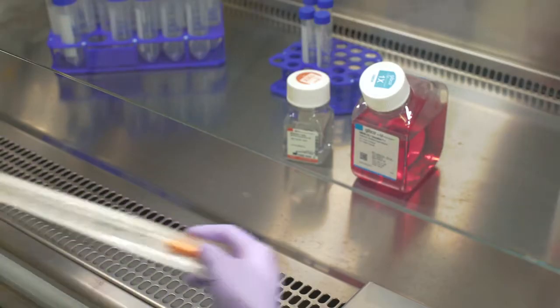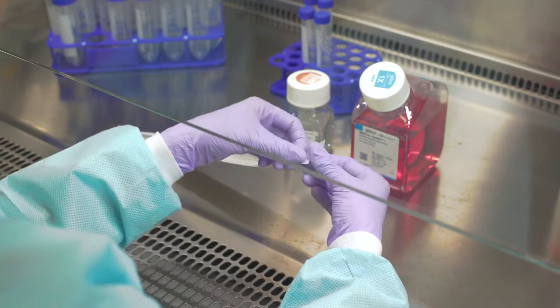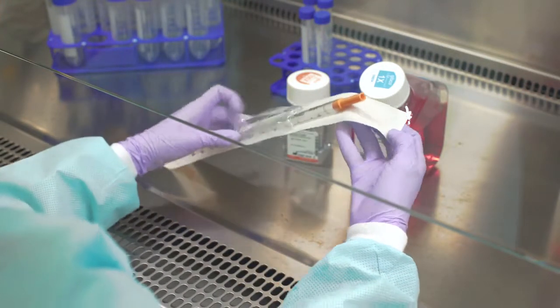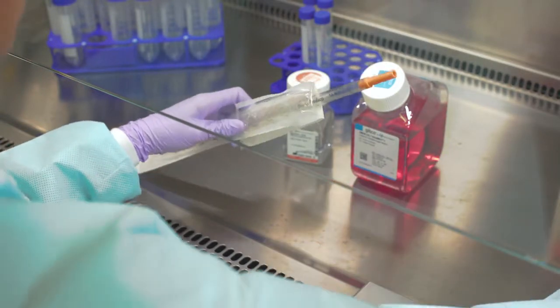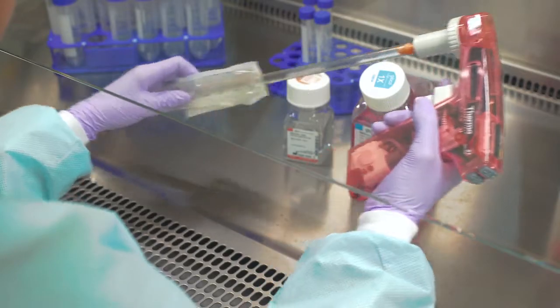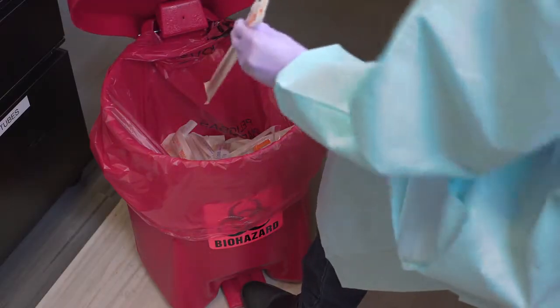When opening the pipette package, be sure the pipette does not touch anything non-sterile. Grasp the pipette high on the neck and insert it into the pipette aid. Turn the desired measurement marks toward you and then discard the wrapper. Discard any pipette you accidentally contaminate.